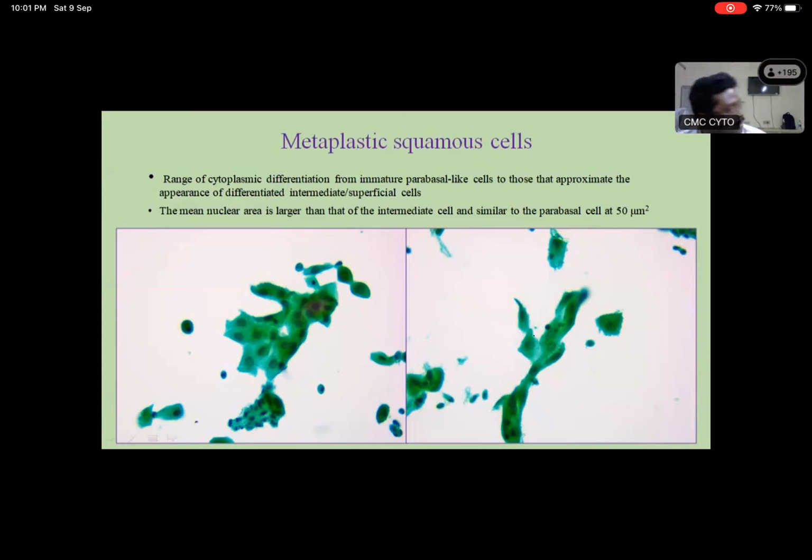Can you please repeat? I think some of the audience can't see the pointers, Dr. Hemant. Could you use a... Okay. So these cells.